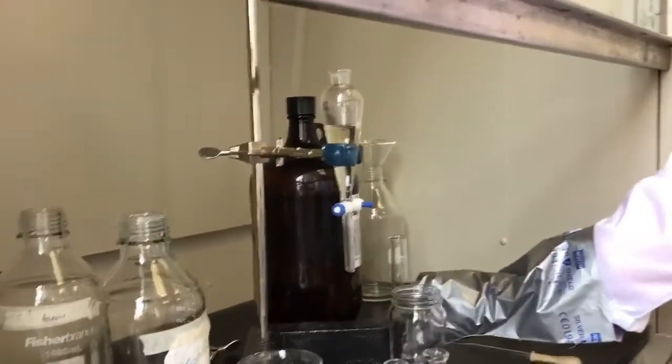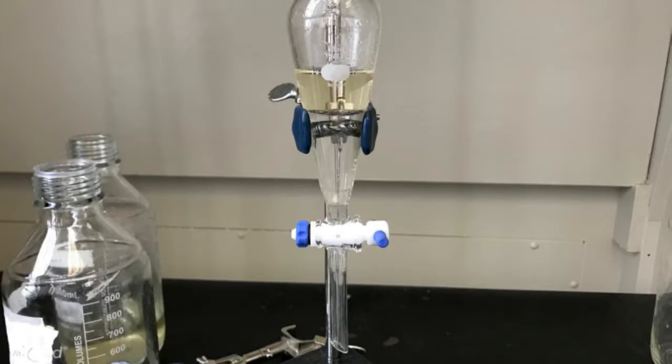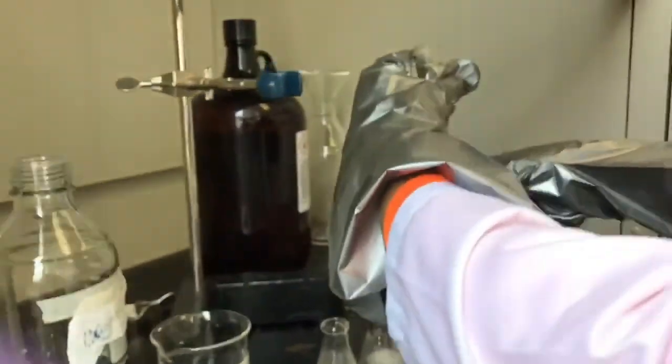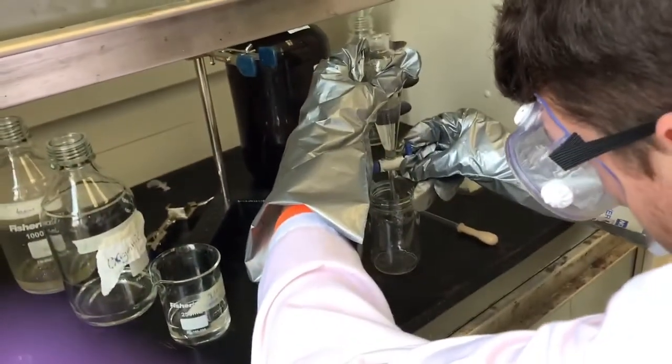You will see that the two separate into 2 distinct phases, making it easy for separation. Separate the organics mixture into a separate beaker.